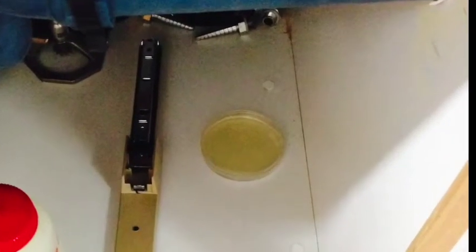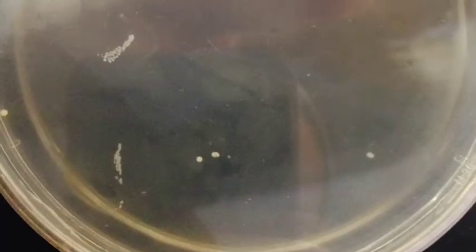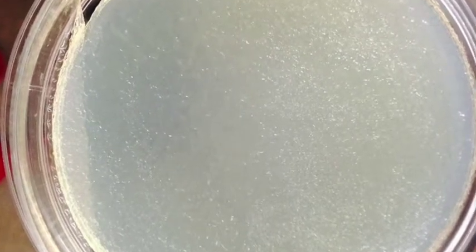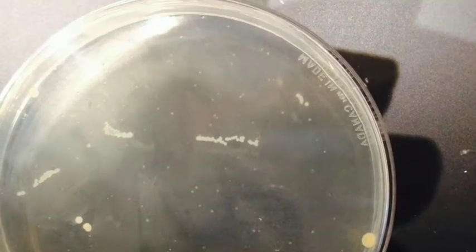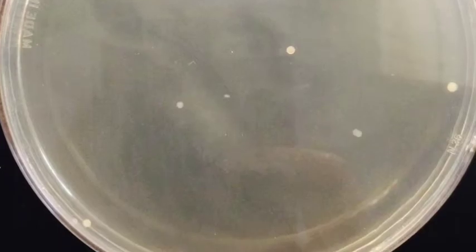We placed this agar plate underneath the sink to see what would happen. You might wonder why agar is like a gelatin, kind of like Jello. Well, it is used for culturing bacteria. The difference between gelatin and agar is that agar will not be eaten by bacteria like Jello would. It is firmer and stronger than gelatin is. The agar plate that was placed underneath the sink just shrunk and did not grow bacteria.